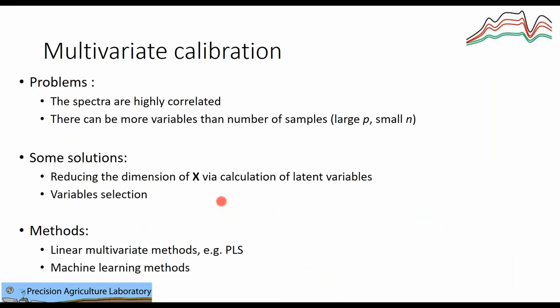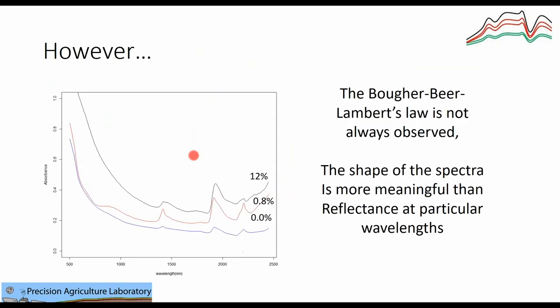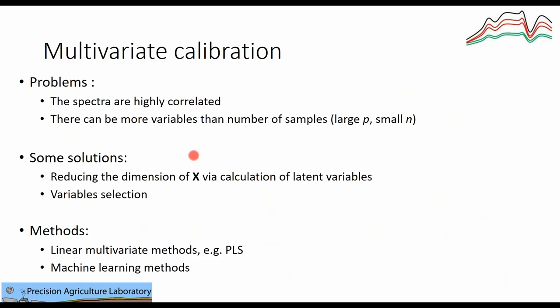That's why the number of variables, which are the wavelengths, is higher than the number of samples. In here we have 3 samples, but we have 1,000 and something variables, okay? The number of wavelengths in this digital signal.